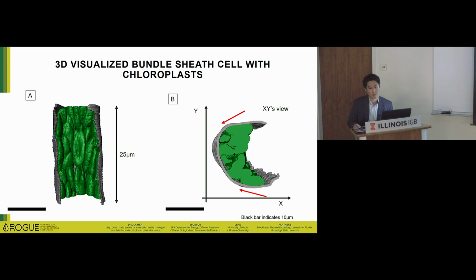My question is, how many samples do you take for good statistics? In this case, because of some limitations of sampling, we collected 3 replications of each species: 3 replications of maize and 3 of sugarcane. We also took 3 images per sample, and then just took the best capture site as a subsample for the analysis.